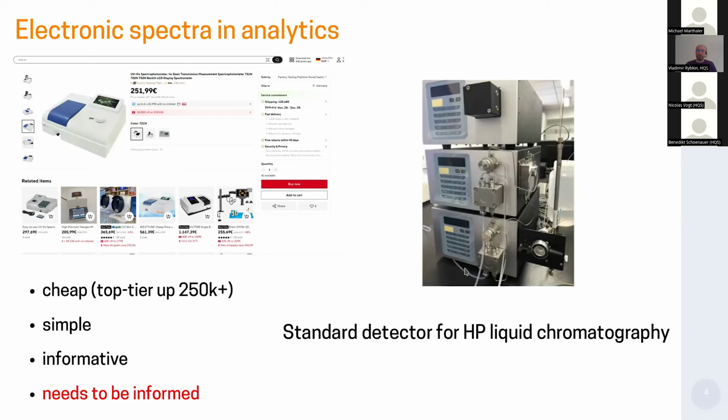There are several blocks of chromatographic columns, and the highest block is typically a UV detector. Then it can also be coupled to a mass spectrometer, but not necessarily. So it's a very common analytic tool. And therefore, it's good to understand, reuse, save, and recycle UV data.